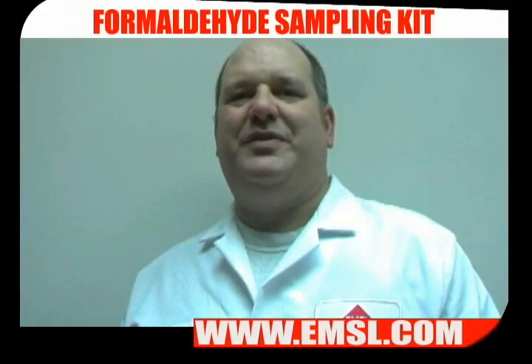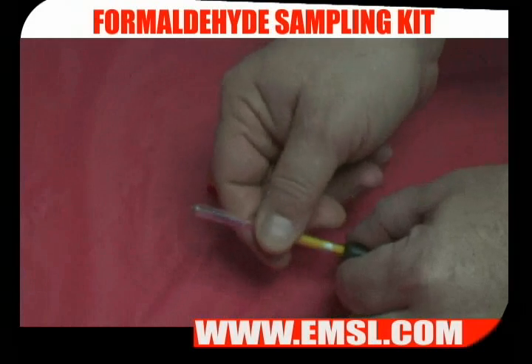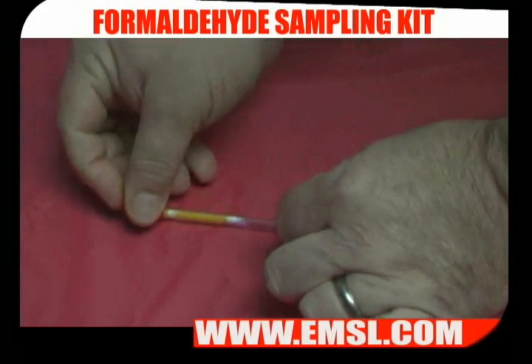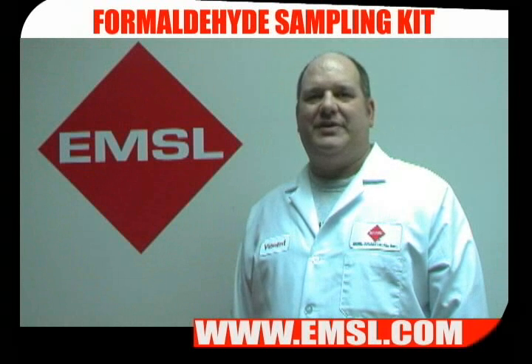The sample should run for 50 minutes. At the end of the sampling, check the flow rate. Next, cap the sorbent tube at both ends and place the tubes back in the cooler for shipment.